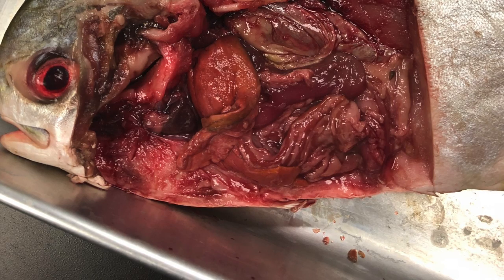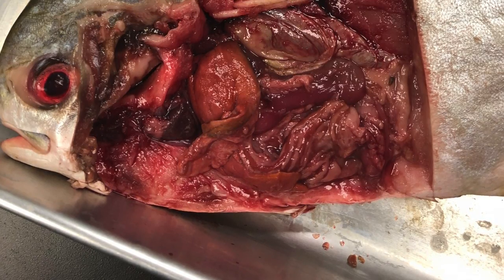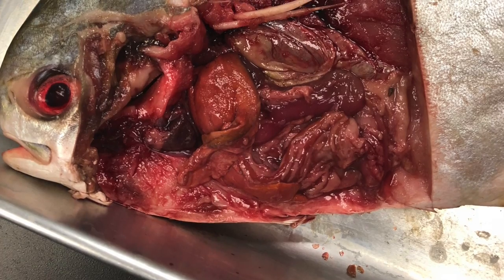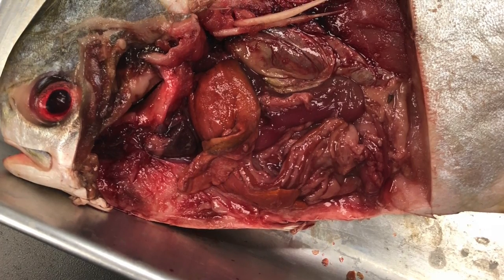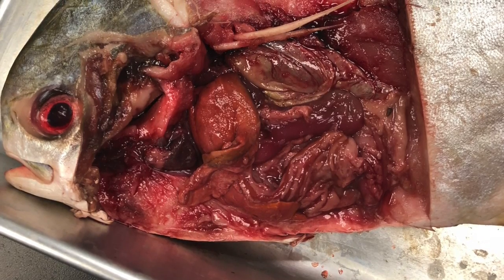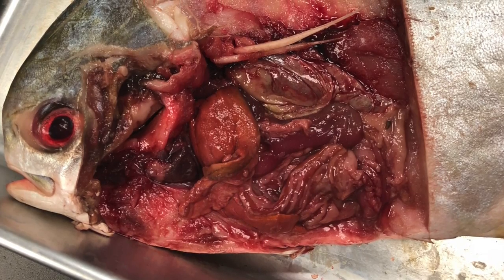Here we have the ray-finned fish. Some of the features of this species include a swim bladder, homocercal tail, ctenoid and cycloid scales, operculum, and an anterior mouth. The swim bladder is a structure in bony fish that allows them to maintain neutral buoyancy. The homocercal tail is beneficial to bony fishes for quick bursts of motion.